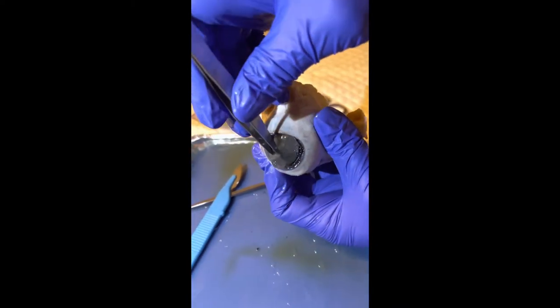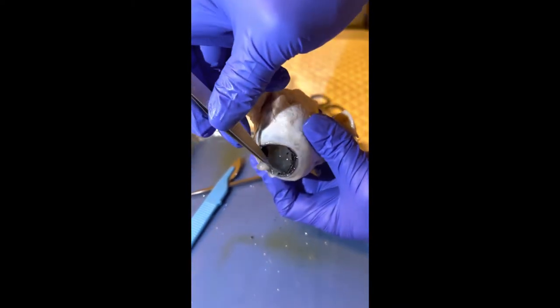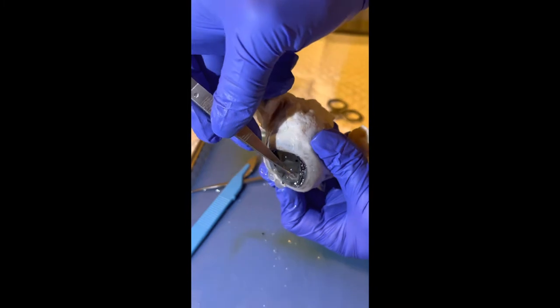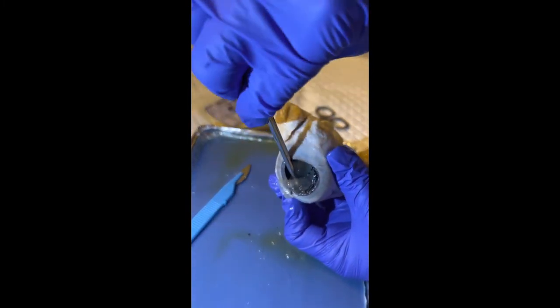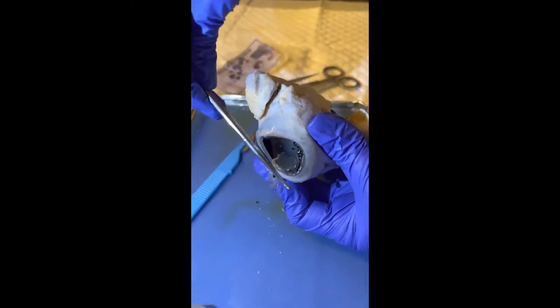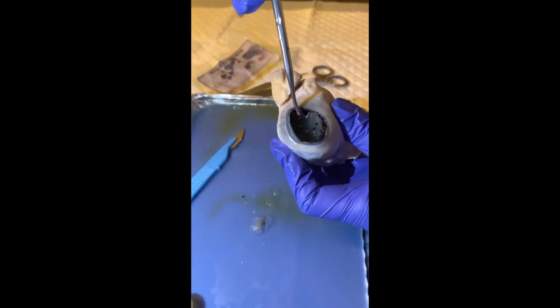Second to last is the retina that is just behind this jelly-like vitreous body. The retina is located in the back wall of the eye where the rod and cone cells connect. This is specific nerve endings for sight.